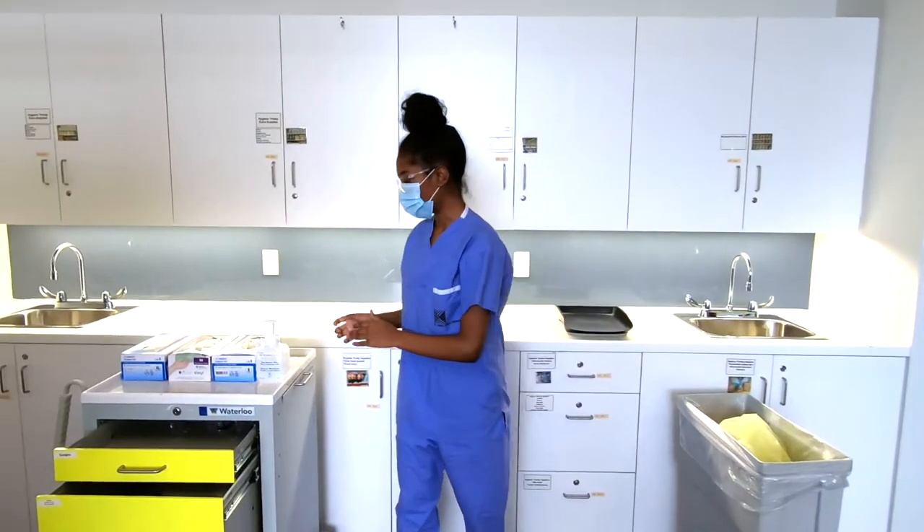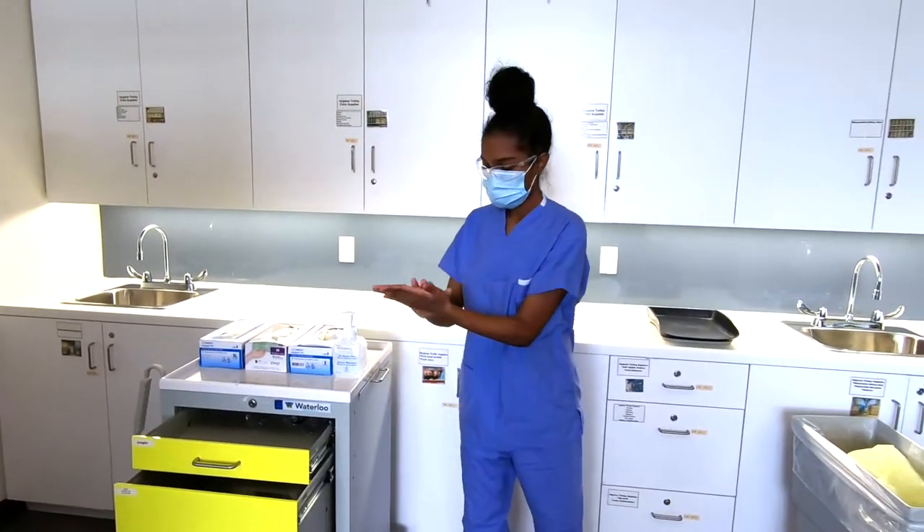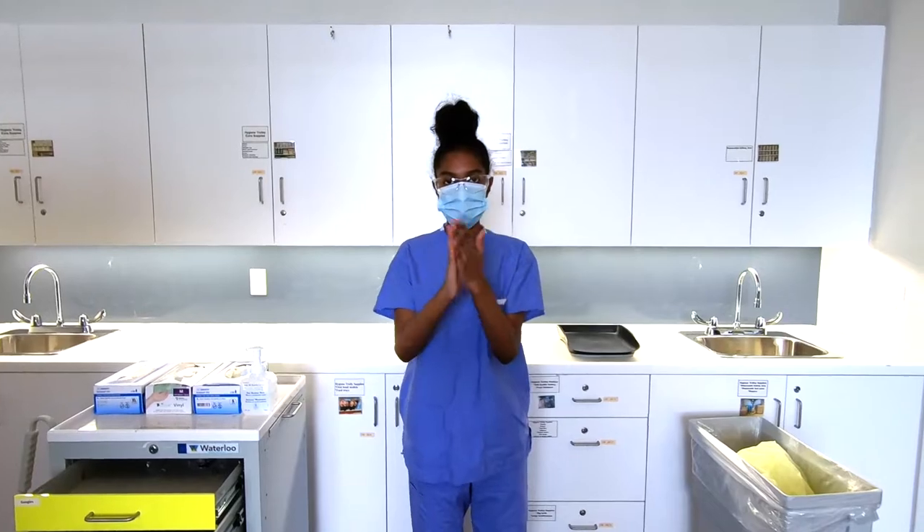Now perform the alcohol hand rub. Rub with the proper technique for about 20 seconds.